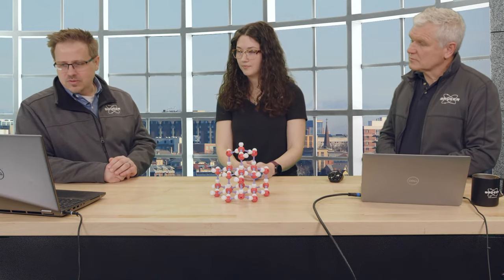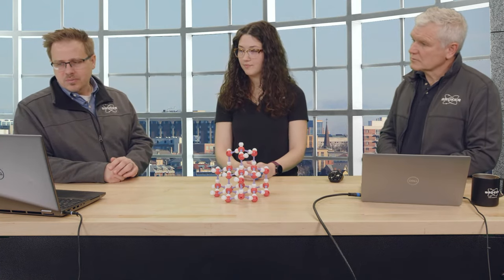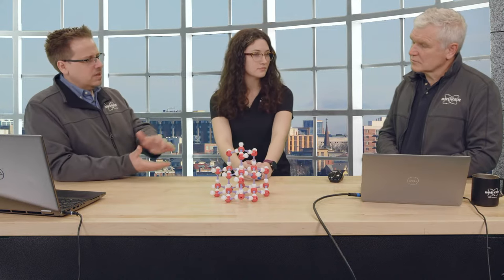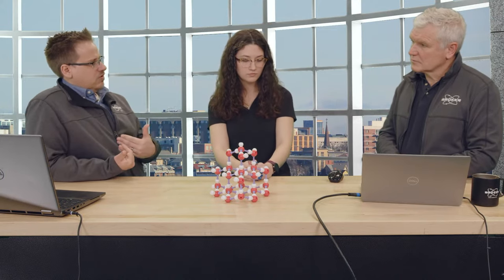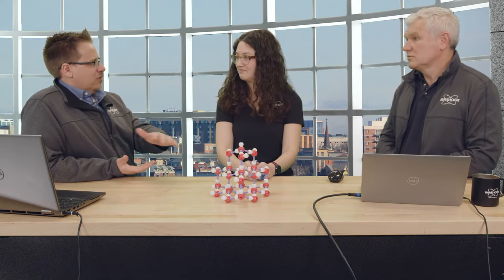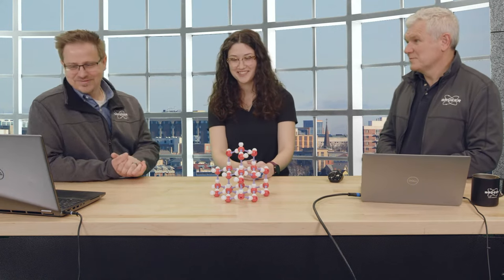Last question, which came in before, from Lauren: how do you decouple thermal vibration from the modulation? Do you actually have to do a step in the software to take out the thermal vibrations before you calculate this modulation? No, and this is where low temperature comes in. Just solve the problem before it's a problem. Yes.